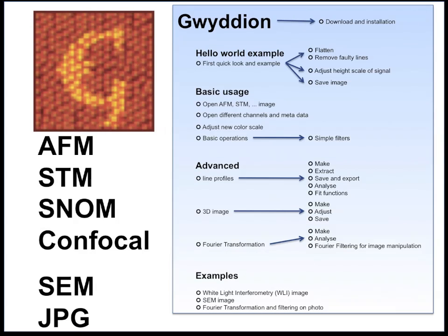First of all, Gwyddion is a program with which you can easily open and analyze AFM, STM, SECM images and many more. These tutorials cover the following topics.